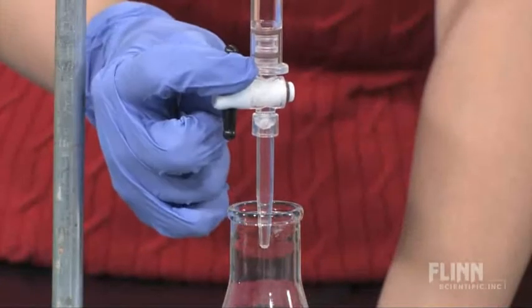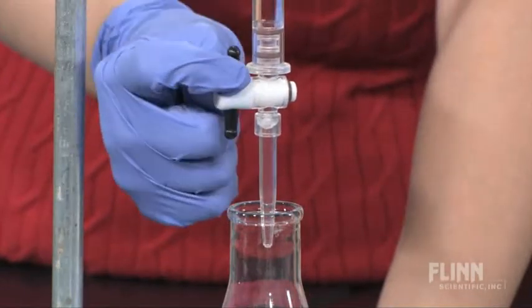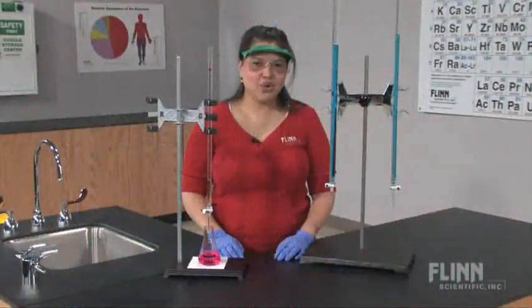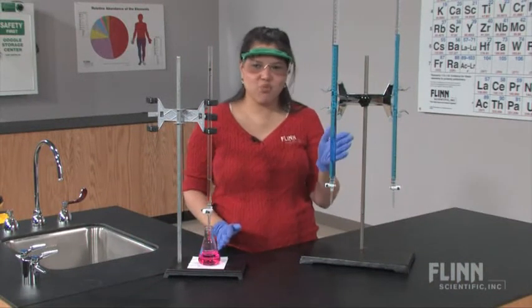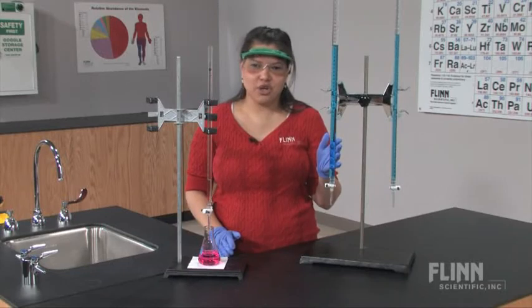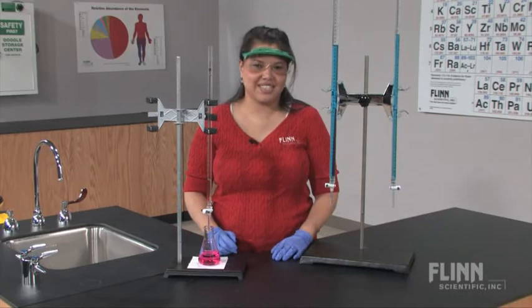Did you know that Teflon is listed in the Guinness Book of World Records as the world's most slippery substance? The acrylic burette comes in convenient 25, 50, and 100 milliliter sizes so you can equip your lab with the perfect burette to meet your needs and ensure your students' success.